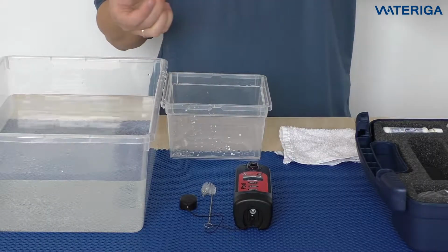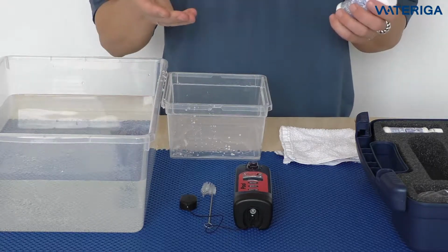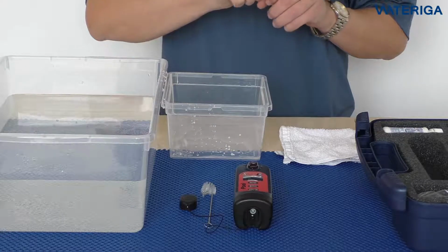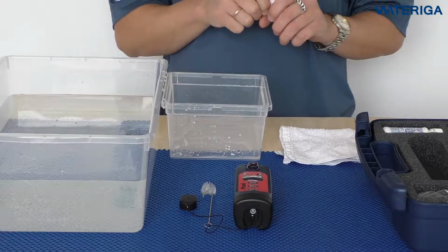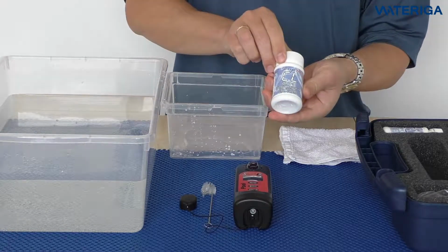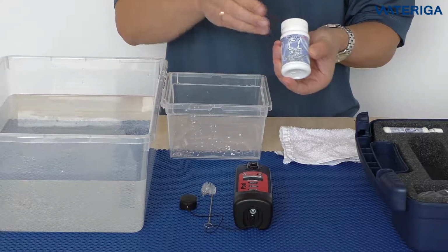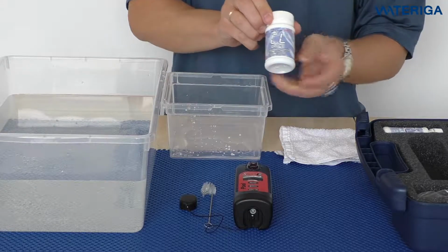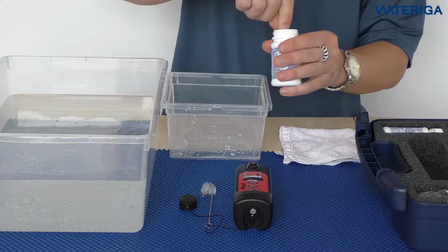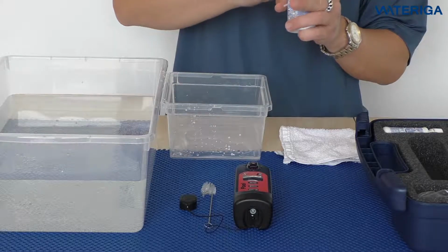This is the only test you will be doing in the same water. For every other test, you would need to dump the water, clean it again, and get a fresh water sample. But for this, it's called combined chlorine DPD3. We'll be using the same water sample that we just used for free chlorine. We take one reagent strip out of DPD3.